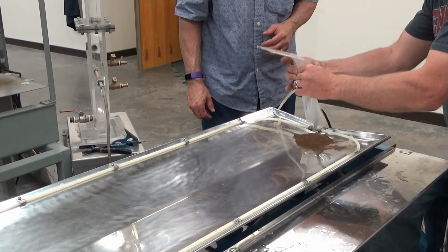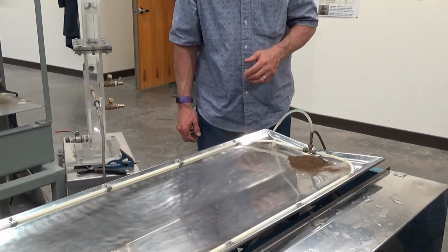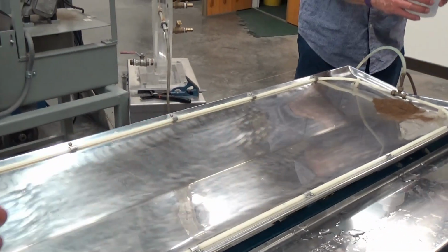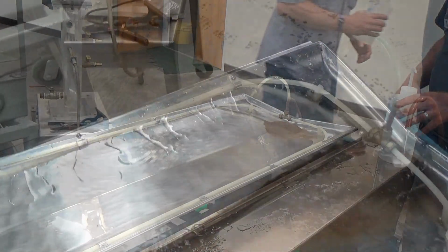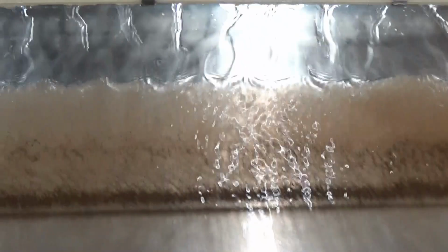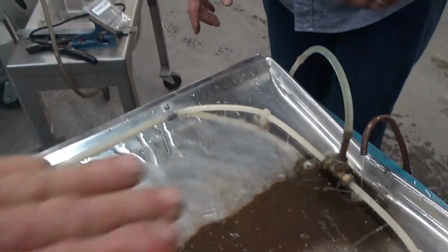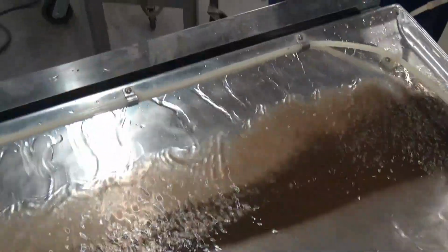And this is the V-shaped tabletop, which handles a little coarser material. Full water bottles. And it will also have a little bumping action in this direction as it works. So we'll see how this works. Supposedly stay right there, they will not move. It's got a little bit of a shallow right, depending on how much we tilt the table. Okay.